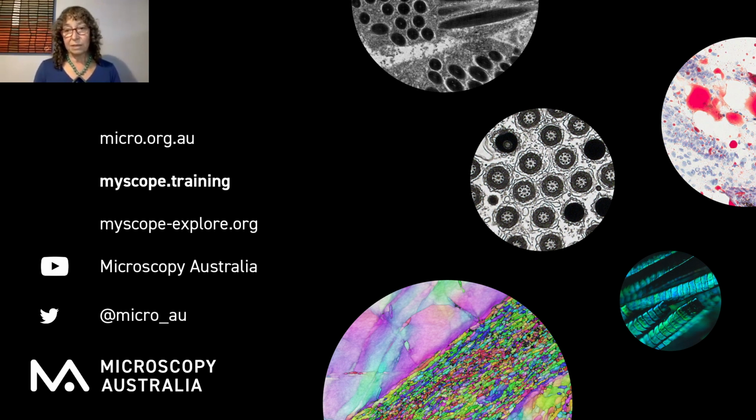The TEM simulator and the TEM module is still the first generation module, and I know there have been some problems with that, for which I apologize, and we're working as best we can to get the new module up and running as soon as possible. Unfortunately there are some limitations in those older modules, which is why we're updating them and making sure that everything runs smoothly with the new code into the future.